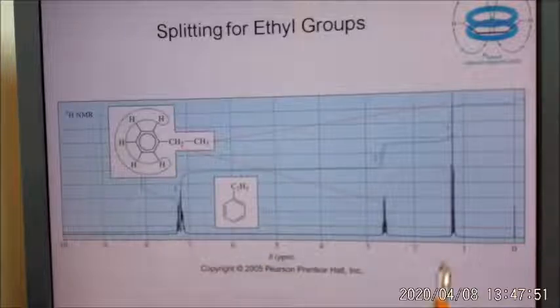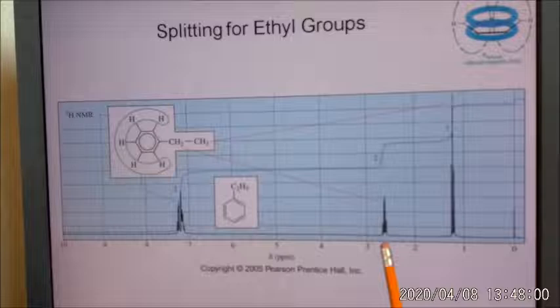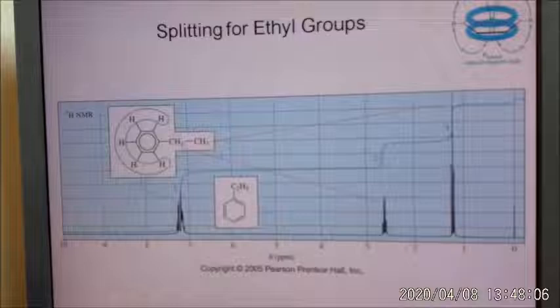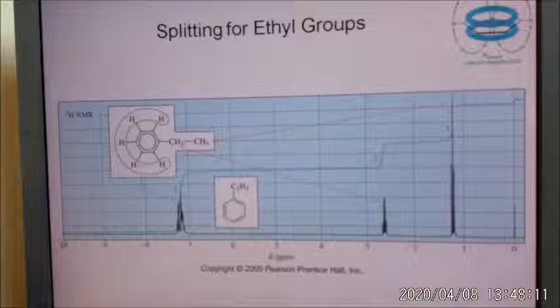And there's another thing you know. So we'll go through the CH2 group, okay? So we know something's electron withdrawing. Instead of me telling you all at once, I'm going to break it down. We did the integration, so you know the number of protons in each group. We're doing the chemical shift, so you know the environment.